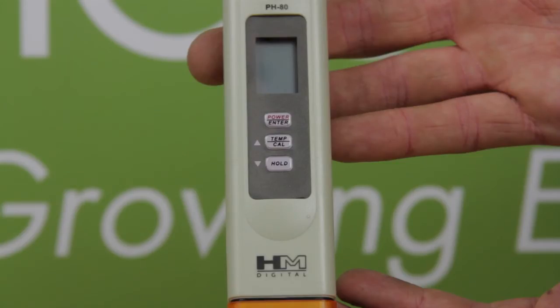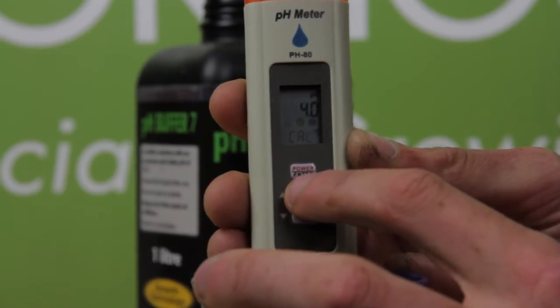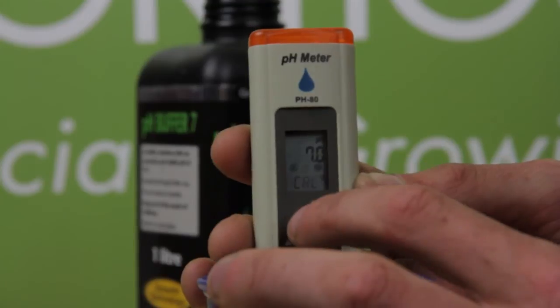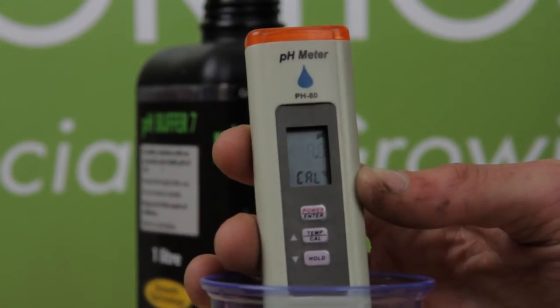You can use them to cycle through which pH you want to calibrate the pen to: pH 4, pH 7, or pH 10. We're using pH buffer 7 solution so we're going to set it to 7. Press enter to do this and hold the pen in the solution.